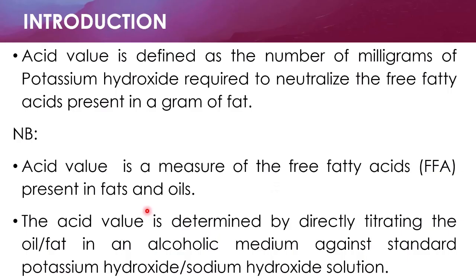The acid value is determined by directly titrating the oil, fat or lipid in an alcoholic medium against standard potassium hydroxide or sodium hydroxide solution. So this is basically the way to determine the acid value of a lipid.